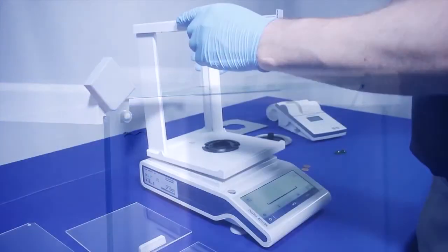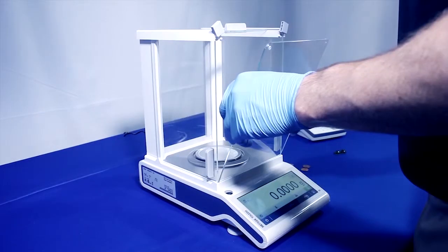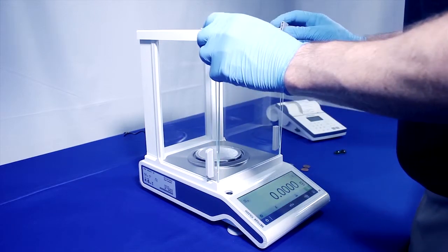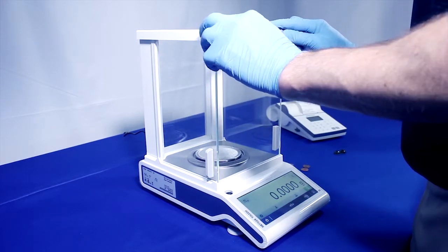On the body of the balance, the quick lock draft shield allows you to remove and reattach the glass panels for cleaning in seconds. No tools required.